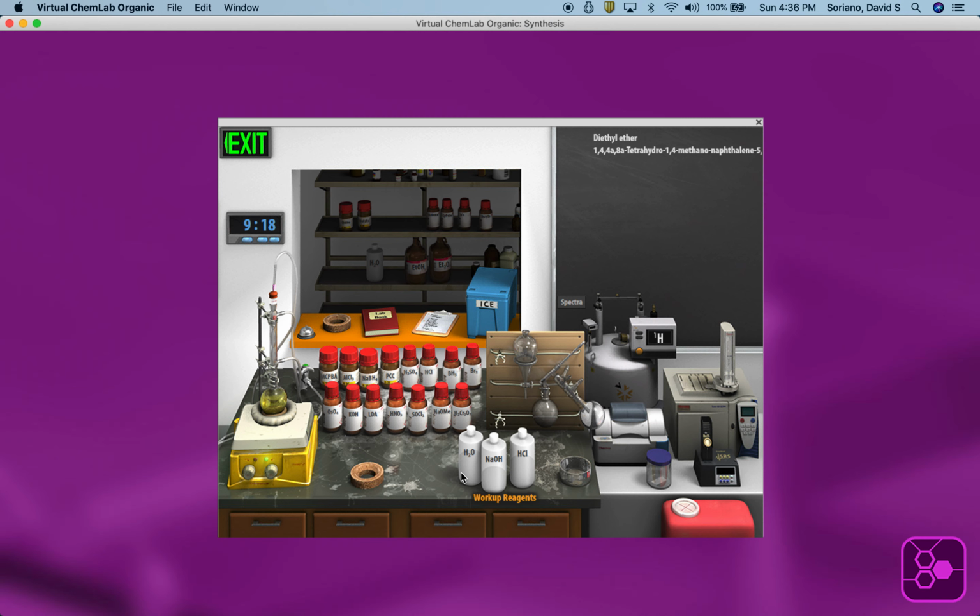Now, the product, if you've done your homework and you look up the melting point, in this case it's a solid, you just want to rotovap off the diethyl ether. Now, the way you can do that in this third approach to work up, I did this in the last 2 videos. I looked at different pathways. You can move that right to the crystallizing dish. Oh no, they won't let me. So, sep funnel, doesn't hurt to wash it. Lower layer water, see there's nothing else in there, but we couldn't be sure. Top layer is what we want. Now see, it's diethyl ether and the product.